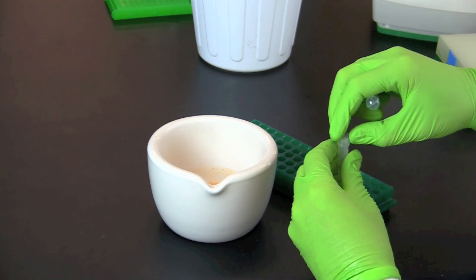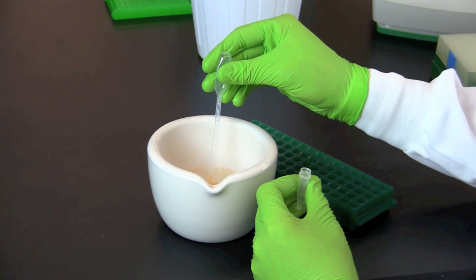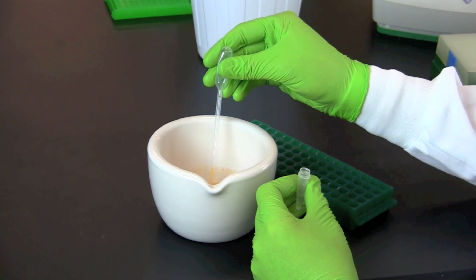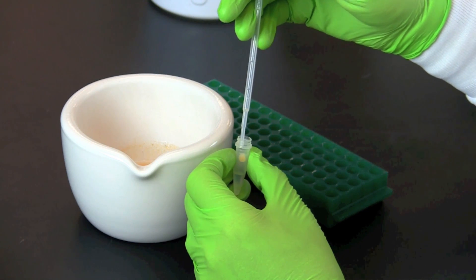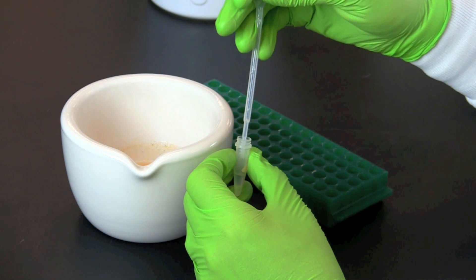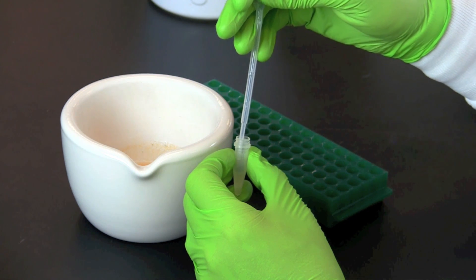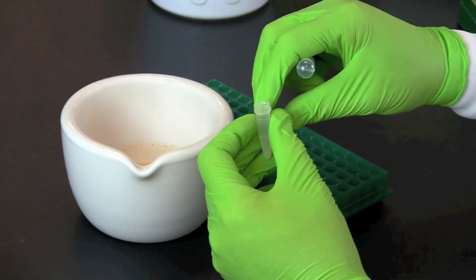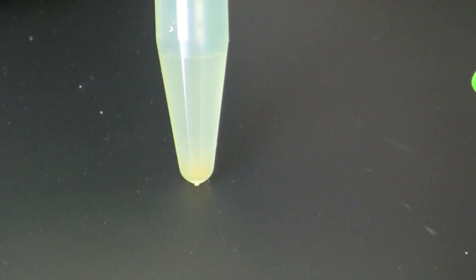Use a graduated 1 milliliter transfer pipette to transfer 50 microliters of ground slurry to the screw cap tube labeled test. Recap the tube and shake or vortex to mix.